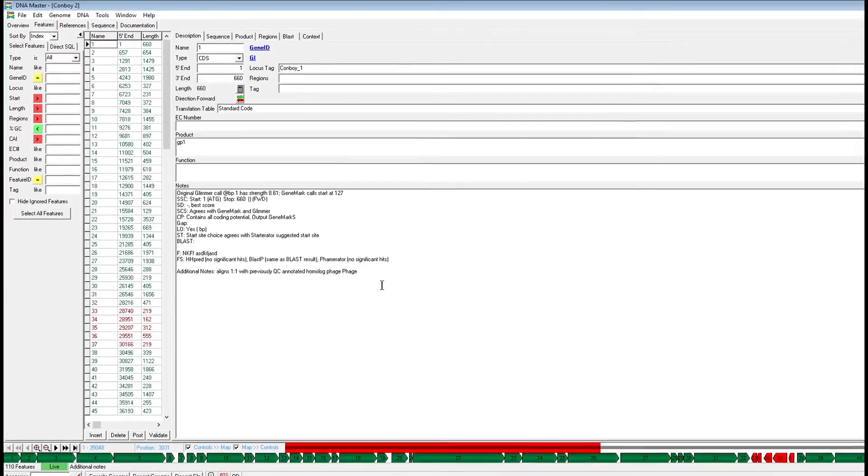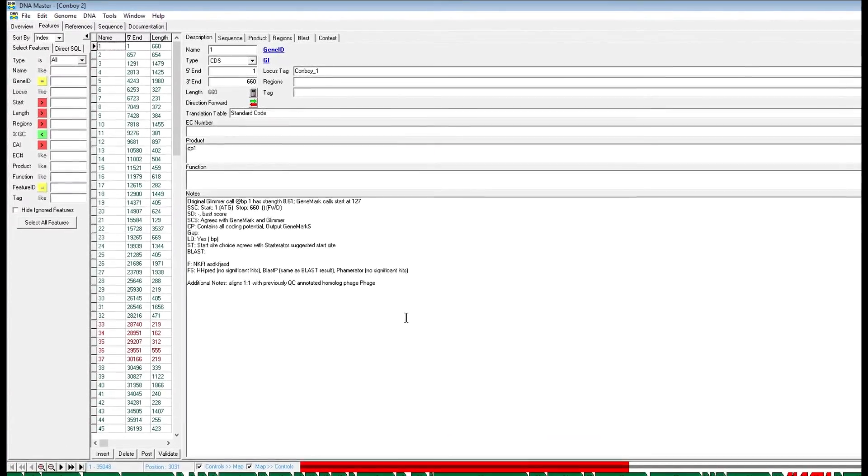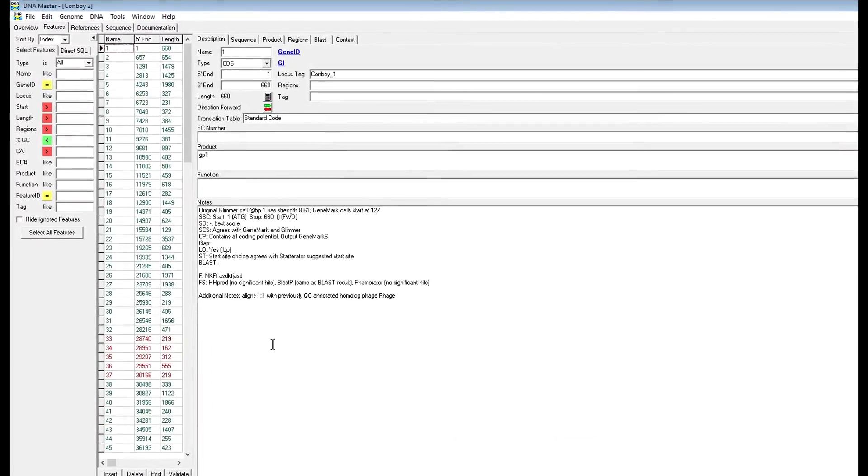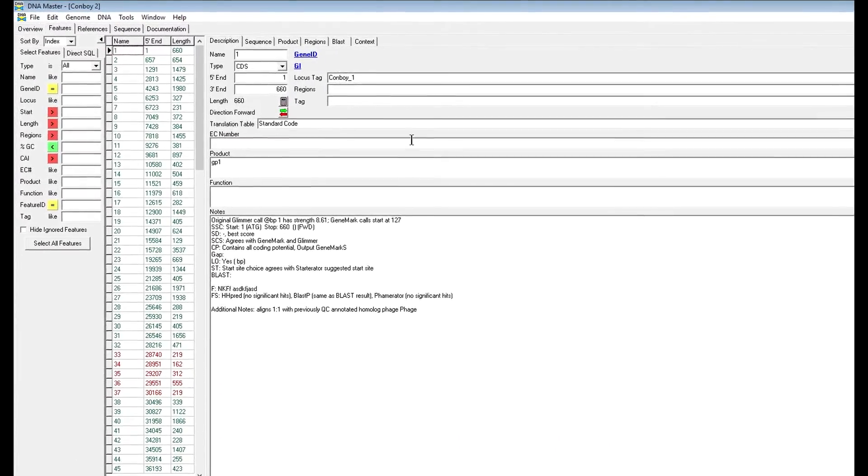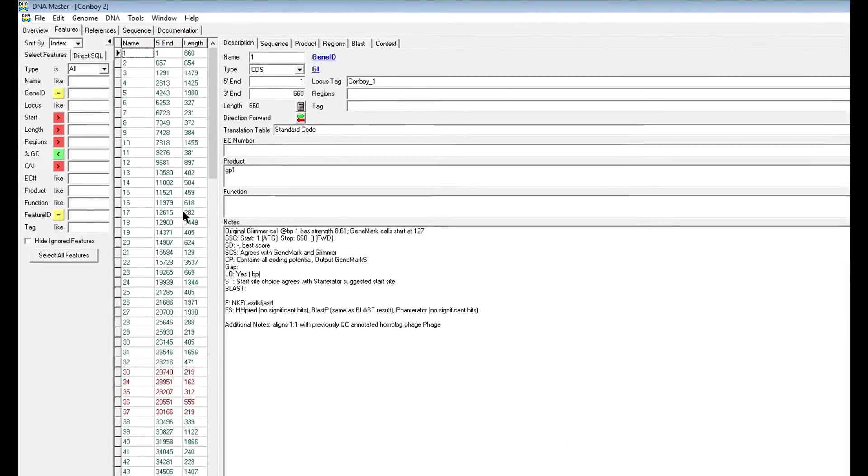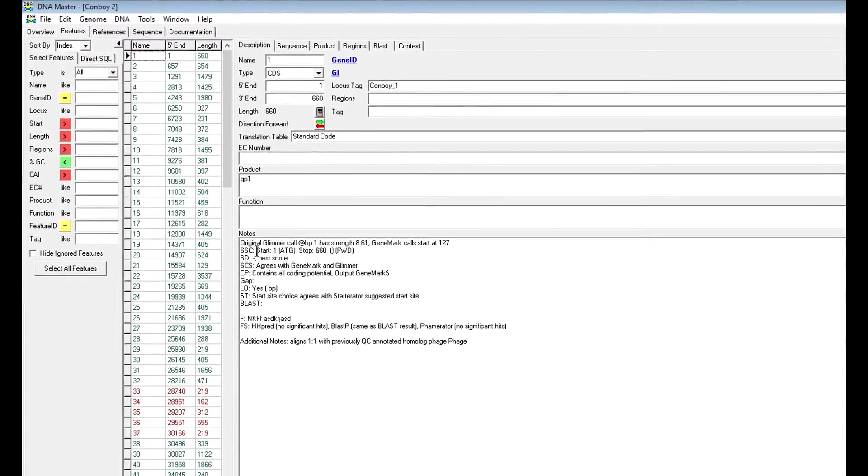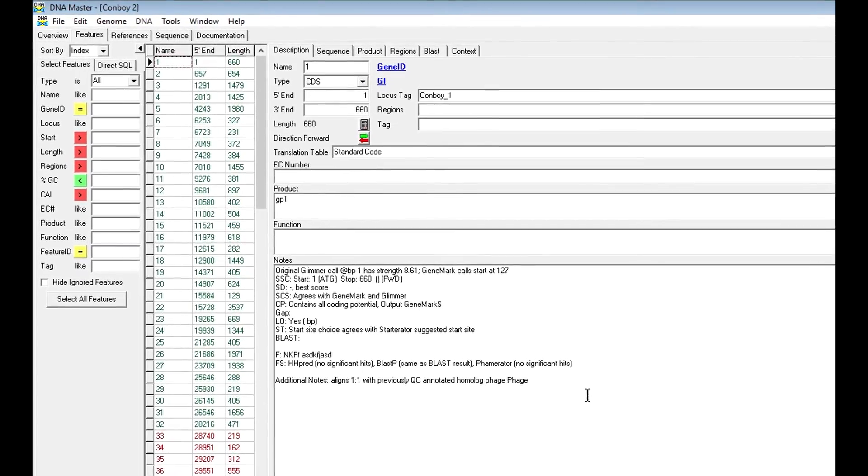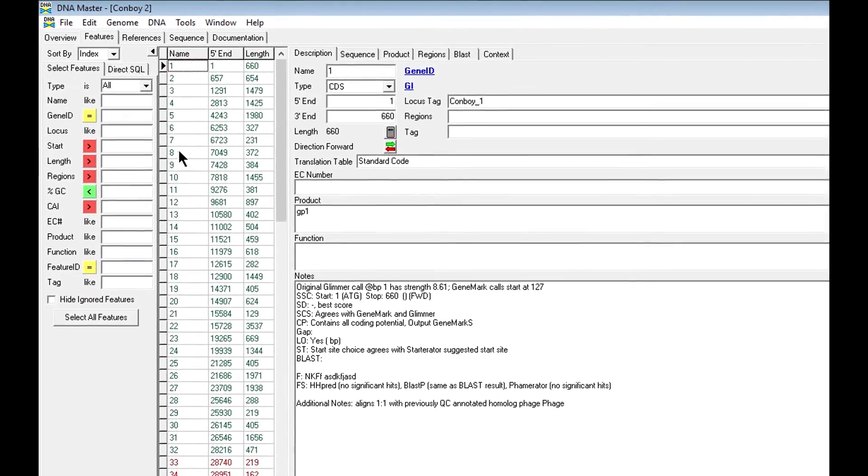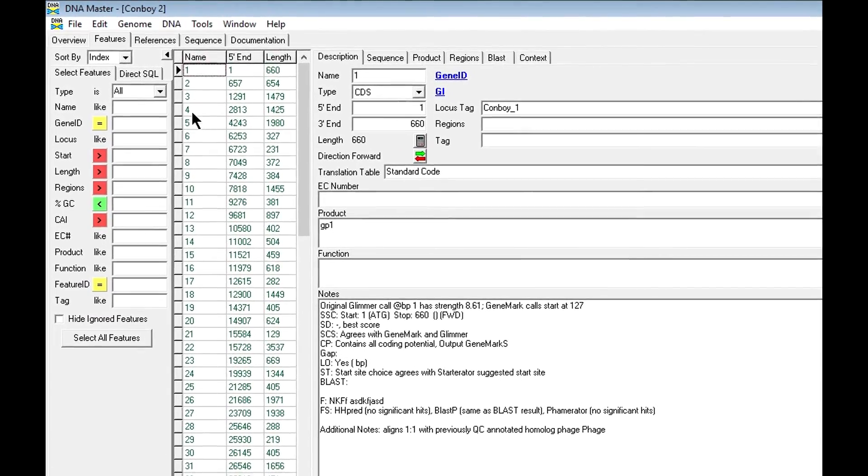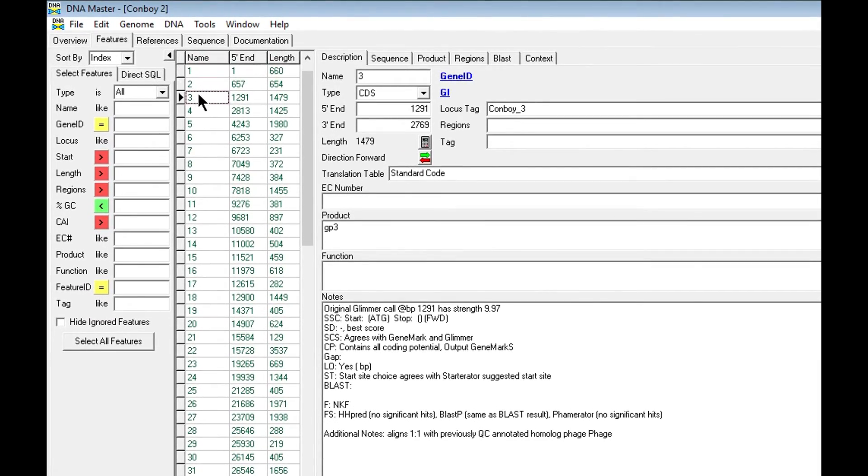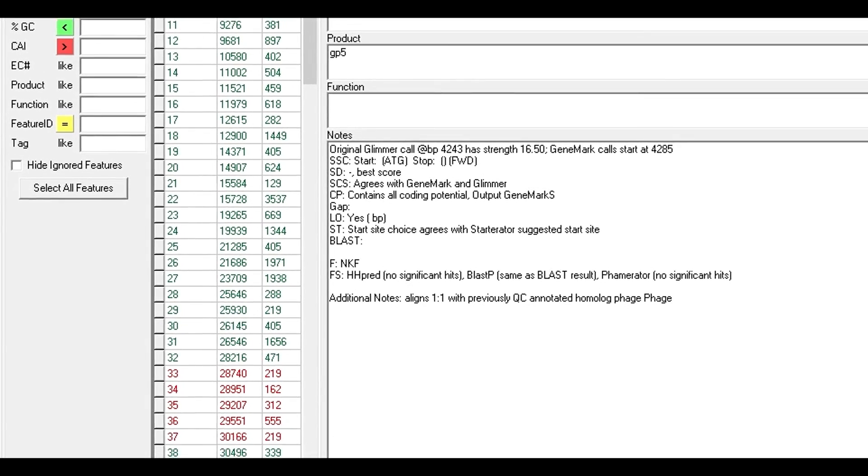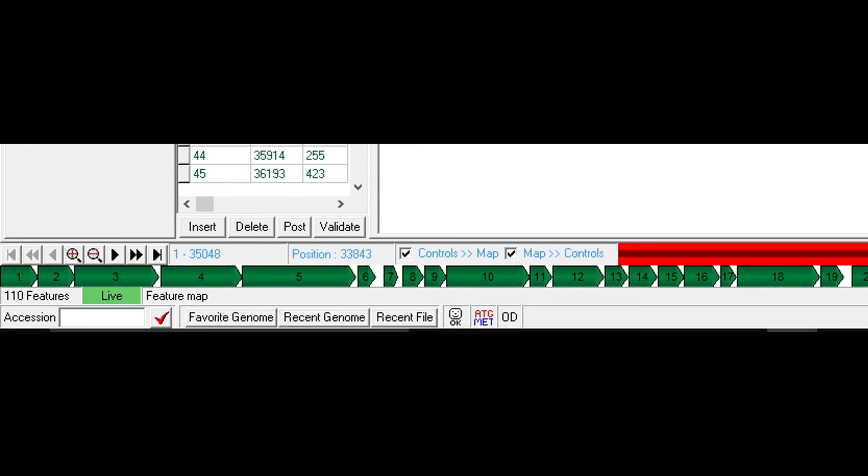After you run the auto annotation feature of the program, you'll get a window like this. It has the notes that you copied into the auto annotation tab and they're available under every single gene. The first thing you want to notice is that there's now a genome map in the bottom portion of the screen. These little green bars and red bars are actually genes.